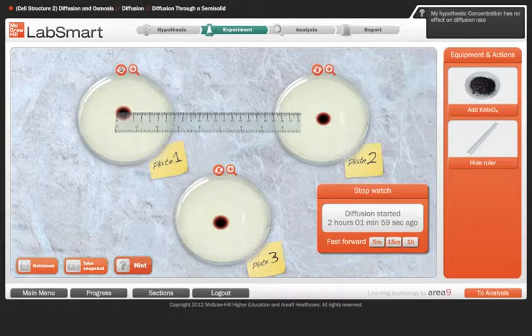So what you have here is a system where a student can experiment, but they're being kept in the confines of, let's say, a box. So if they try and step outside of the box and do something entirely crazy, they're not allowed to do that, but they can experiment within the confines of this box, and that's good for students as they need a little bit of structure.